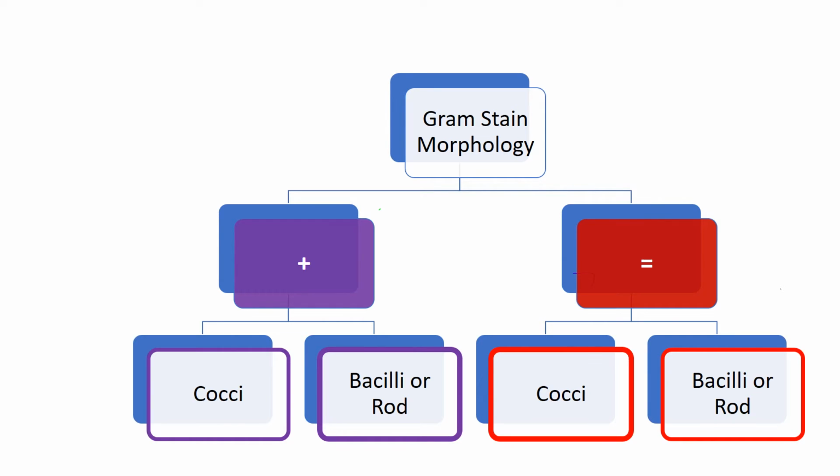And once again, characterize the shape of the organism, whether it be a cocci or rod, or we call them bacilli. When it comes to gram-negative bacteria, we'll have to admit that it becomes more challenging to describe its microscopic morphology, except for the Neisseria or Moraxella species. We have already talked about this, but as we will cover later on, you may find that certain gram-negative rods will appear and could be mistaken as gram-negative cocci.